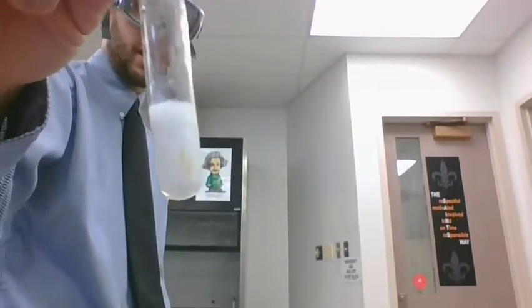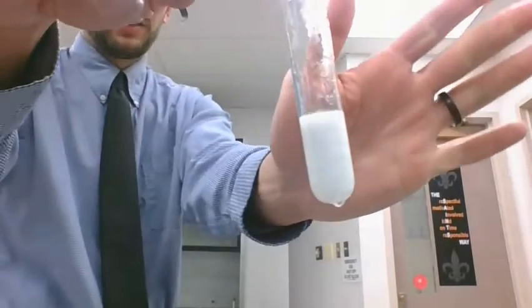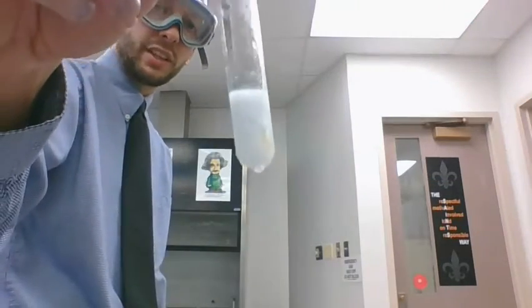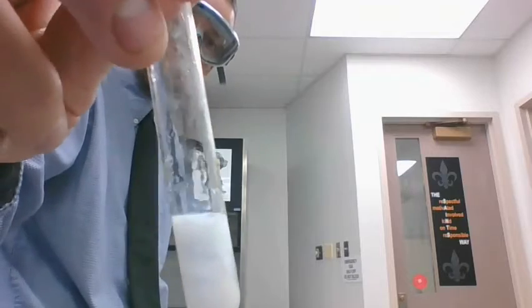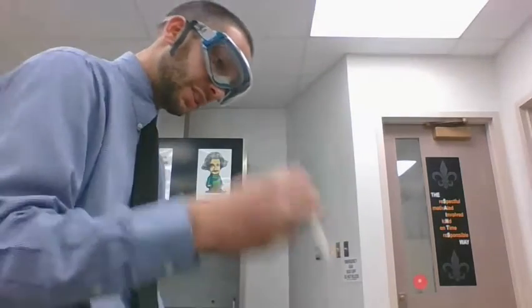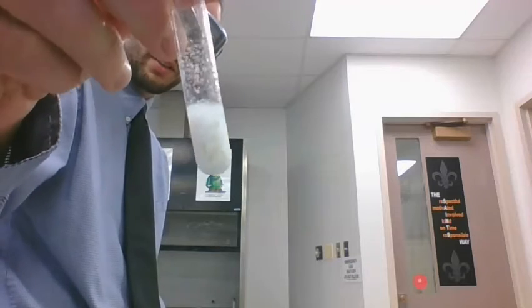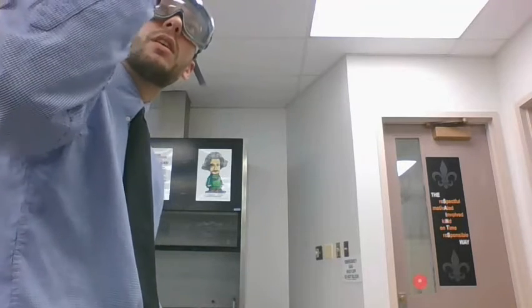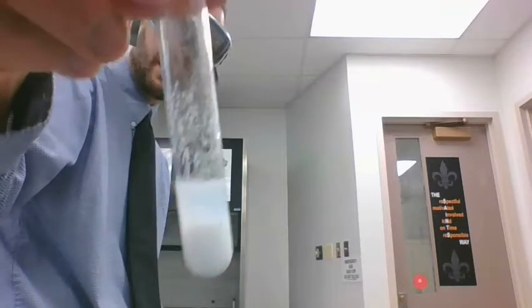It's definitely not clear anymore. You can't see through that. It's white, maybe foamy. It looks like some sort of solid formed inside there. See if I can mix that for a minute. If you look, there's some kind of powder that formed on the side.